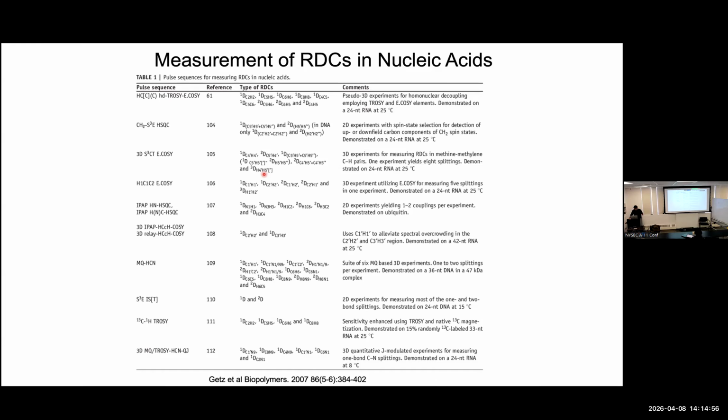The thing that I'll maybe point out is that in addition to measuring splittings, which is very obvious, when you have a splitting, it's disadvantageous because you have double peaks, and in NMR we are always aware of overlap. So you get to a fun experiment where you encode only one resonance, where in your spectrum you only have the one resonance or the other, not both together. Then you can measure the subspectrum in one experiment and the subspectrum in the other experiment, without doubling the peaks. So you guys did in-phase and anti-phase.